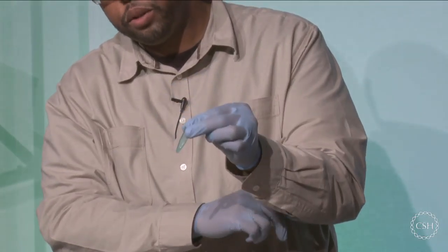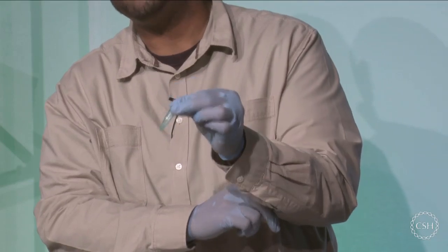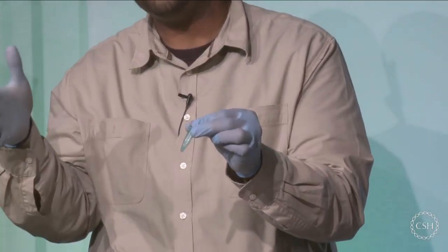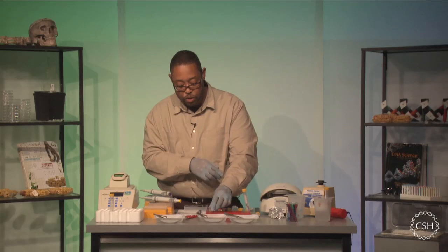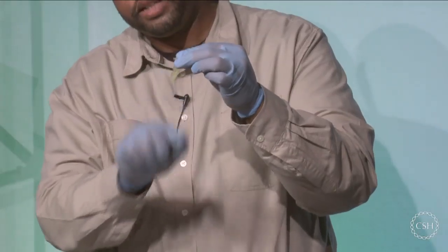And you can see that my solution now is a little cloudy. This is actually very important to show that you've mixed the silica resin very well. This allows the silica resin to distribute throughout the entire supernatant and bind up as much DNA as physically possible. I'm going to move to doing this also for my other two samples. So I'm going to finger vortex this one.